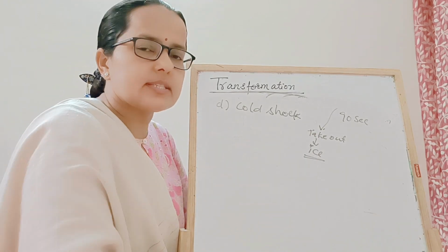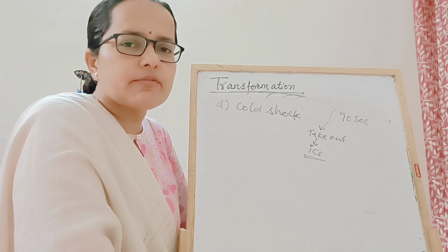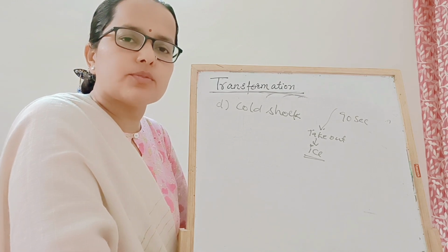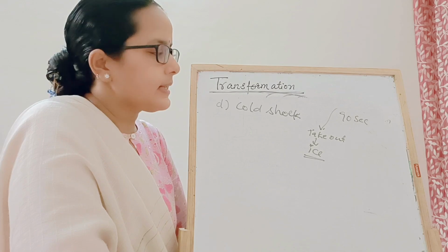Some papers say 2 minutes is enough cold shock. Some studies say 4 minutes, 5 minutes, 10. But if you give 10 to 15 minutes, that is more than sufficient for the recovery.